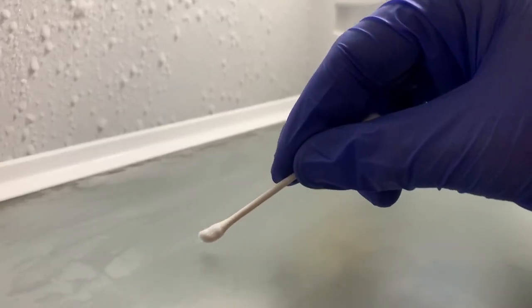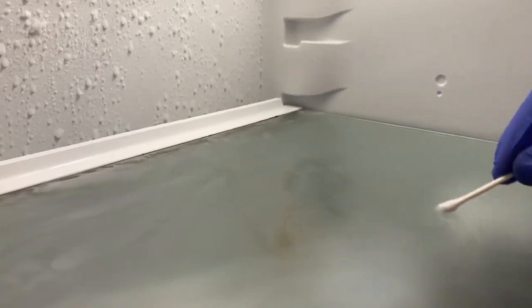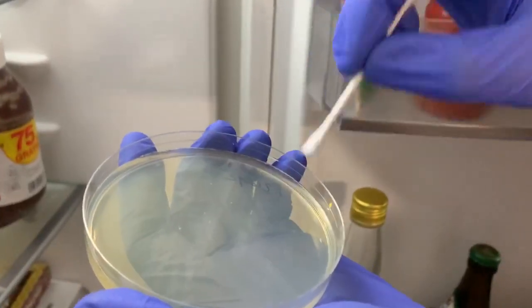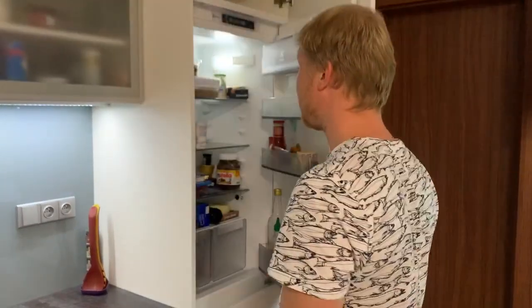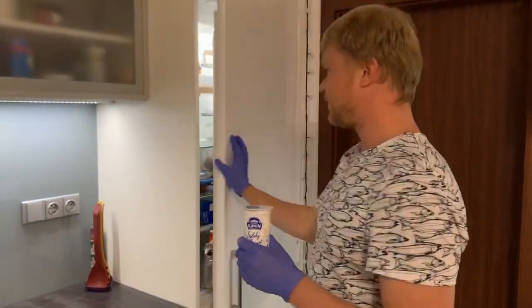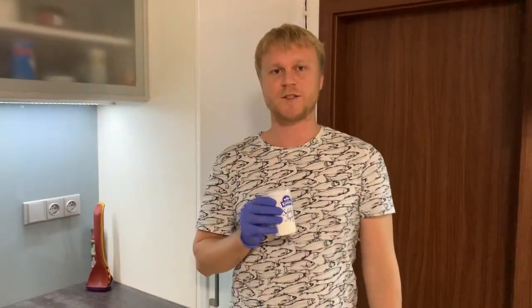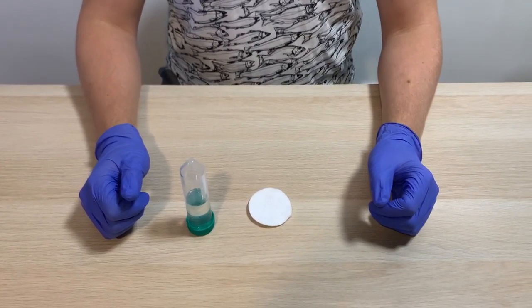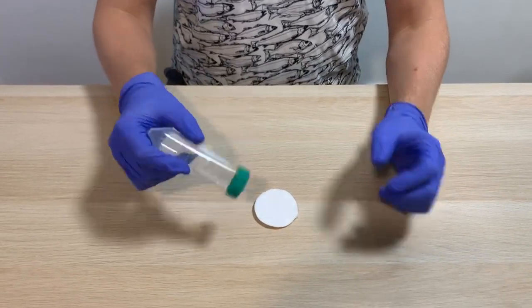Moreover, you can find bacteria in your fridge. Despite cold conditions, life is flourishing there. Let's check what we also have in the fridge — yogurt. Several bacteria species, such as Lactobacillus and Bifidobacterium, transform milk into yogurt, and still they are doing their work when we eat it. Before starting the experiment, let's prepare our workspace. Wipe the table and gloves with ethanol.